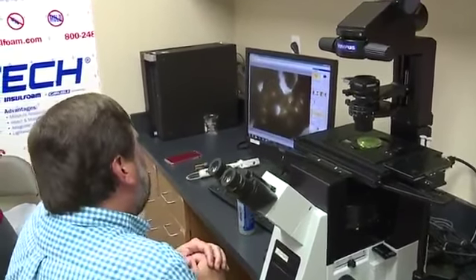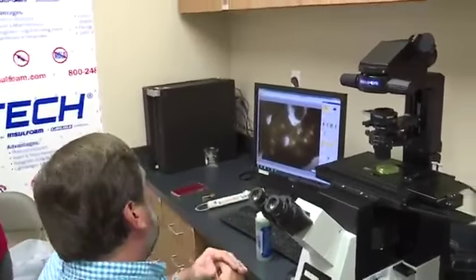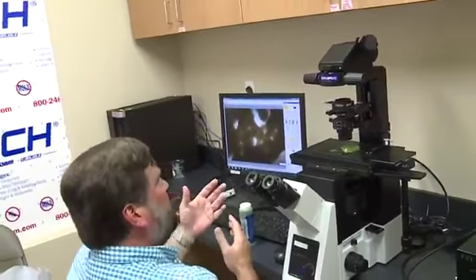Yeah, that's strong. So I would say what we learned here is that we're still looking at microcystis. The color change is not because of another cyanobacteria present in the sample. It looks like it's degrading, so the color change is related to the cells breaking up and releasing the compounds. Their color is changing as those compounds are either being oxidized or broken down by bacteria. Then these really smelly compounds are given off, and they'll volatilize, get up into the air, and then we breathe it in. All those compounds we're sensitive to, if you think about ammonia or rotten egg smell, and some compounds that most people don't realize we're really, really sensitive to would be these musky flavor or musky odor compounds.